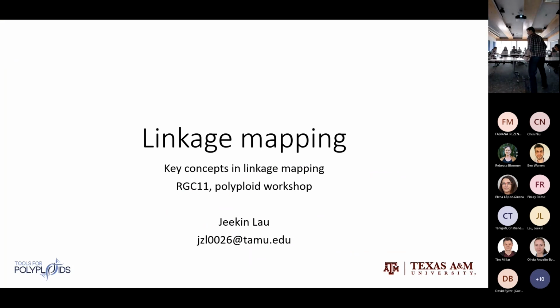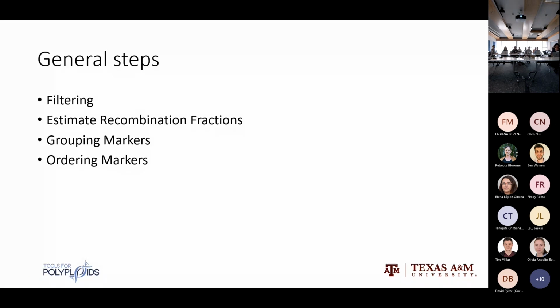All right, we'll go through a really quick PowerPoint, what we're going to be doing, key concepts in both linkage mapping, QTL mapping, GWAS, and then we're going to go through an example. So, general steps of linkage mapping.